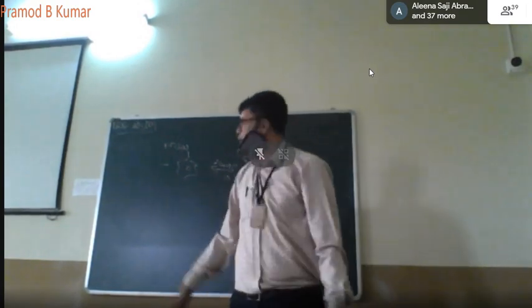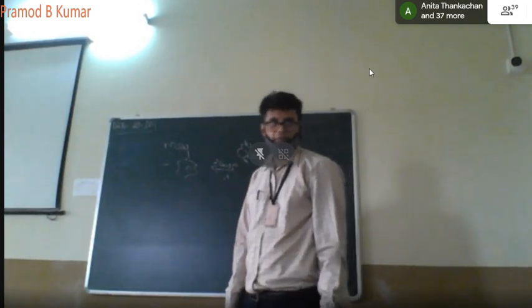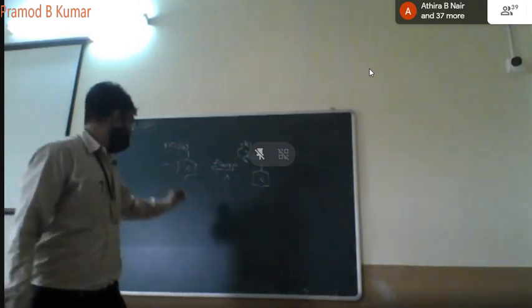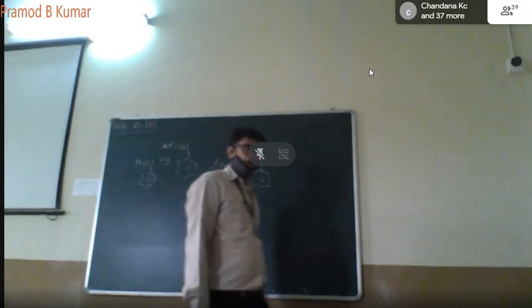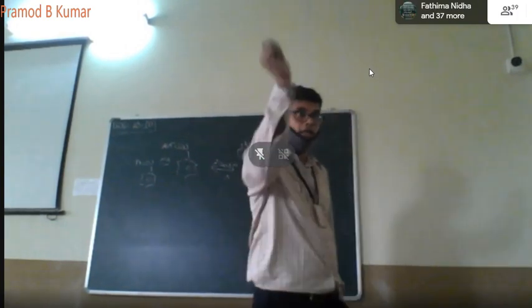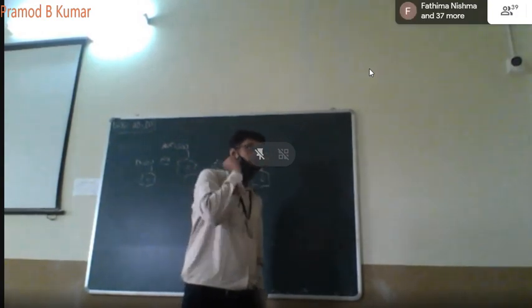The product formed is the sodium salt of benzoate, sodium benzoate, which is treated with HCl to get your benzoic acid. Basically because of sodium hydroxide it becomes sodium benzoate, so that when you treat it with HCl, you neutralize it and get your benzoic acid. Understood? This was the seventh reaction, an example of alkaline hydrolysis or saponification.